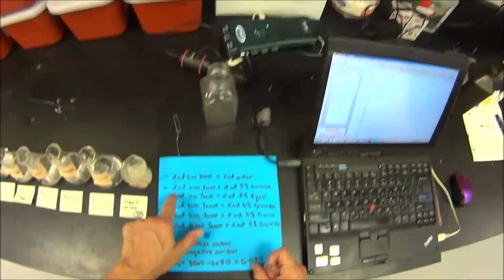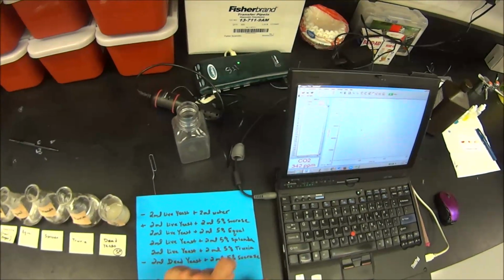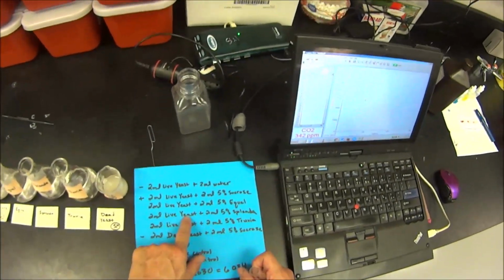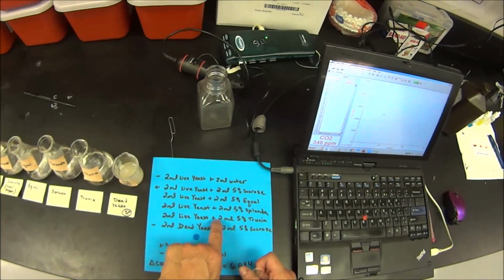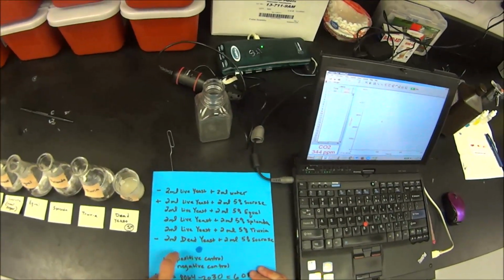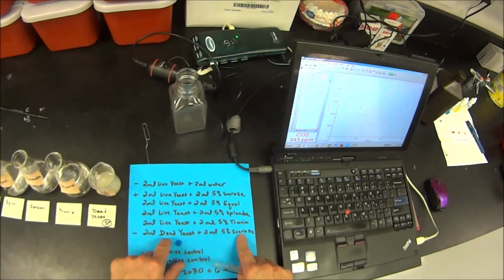And then I'll keep going, adding 2 ml of live yeast. Next, I'll make up 2 ml of 5% Equal, 2 ml of live yeast, 2 ml of 5% Splenda, 2 ml live yeast, 2 ml 5% Truvia, and lastly 2 ml of dead yeast with 2 ml sucrose.